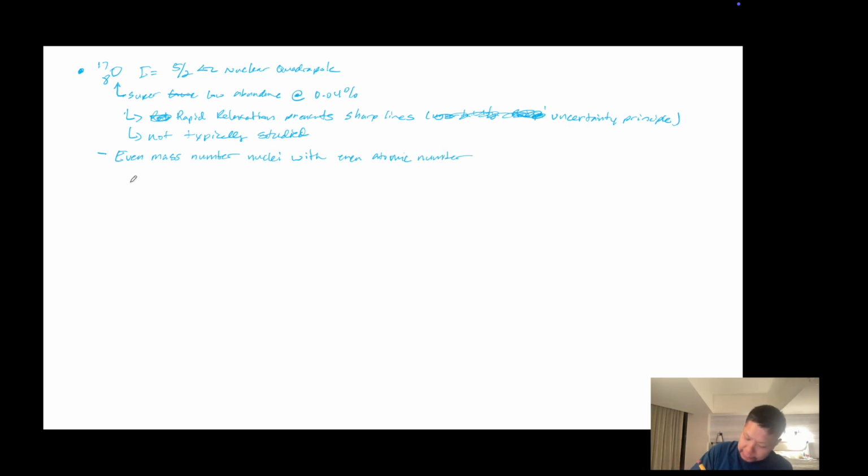And so that would include things like our normal old carbon 12 and oxygen 16.